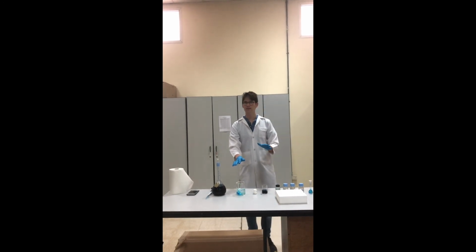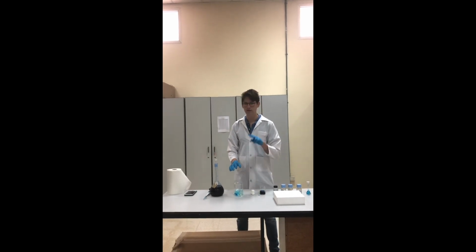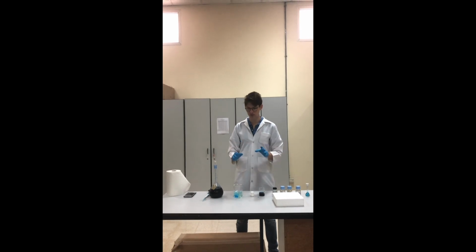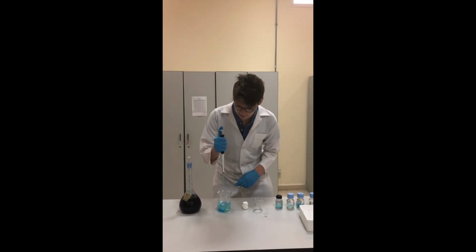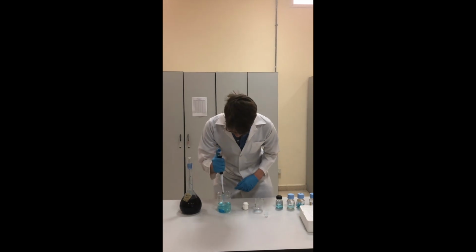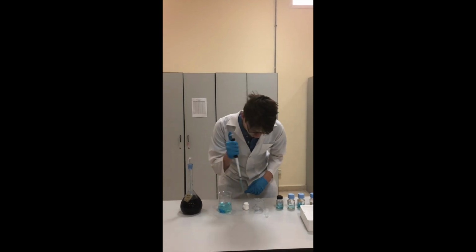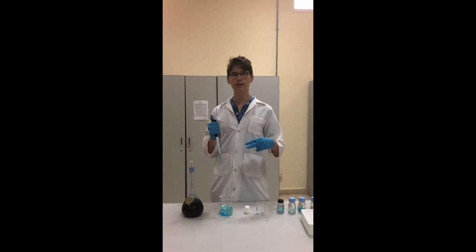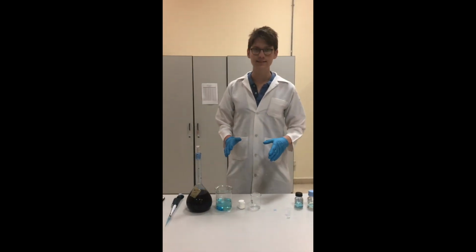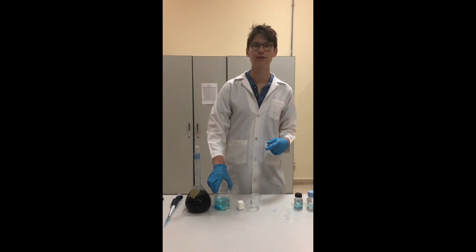So, the next steps are to take samples every 2 minutes. We're going to leave it for 60 minutes in total, and every 2 minutes we're going to take samples with a pipette. 2 minutes have passed. We're going to take the sample now. It's important that we always put the pipette in at the same location and at the same depth. We're going to put it into the cuvette. We're going to repeat the whole process every 2 minutes for a total of 60 minutes. After this, the same procedure will be repeated for a beaker with hot water at a temperature of 55 Celsius.